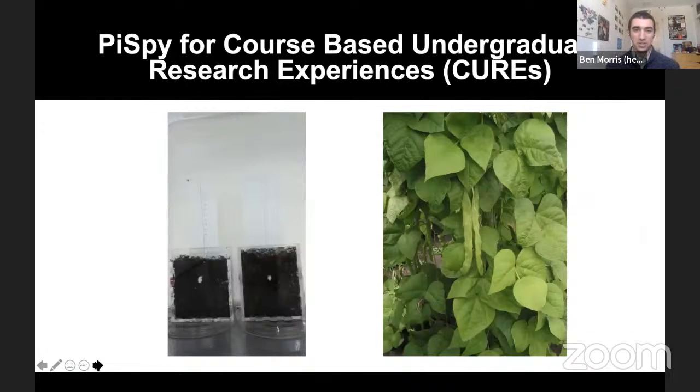I also used the PiSpy for one of my classes. I had a biostats and experimental design course last spring, which was when I was ramping up some of the work I was doing with the PiSpy, especially these bean time lapses. We had an independent project at the end of the class, and I realized that project was the perfect opportunity to use the PiSpy to generate some quantitative data and test its use in measuring bean growth.